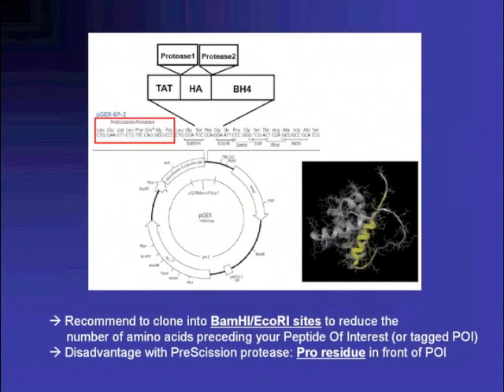No, that's a good answer. If it's all aggregated, then you can't necessarily access the cleavage site. Of course, the question might come from somebody who already tried and it's not an aggregate and still it does not work. Yeah, I don't know. I suppose that's in-depth, that could take a long time to answer.